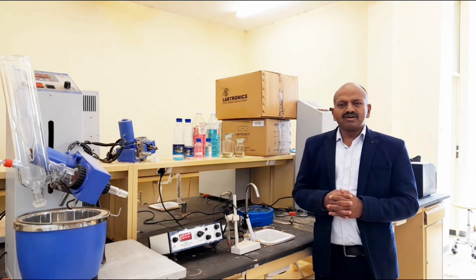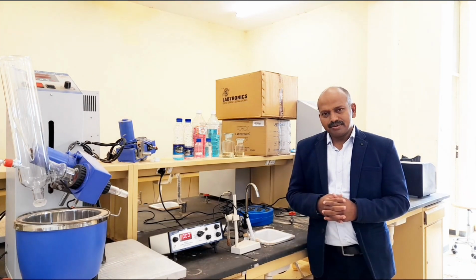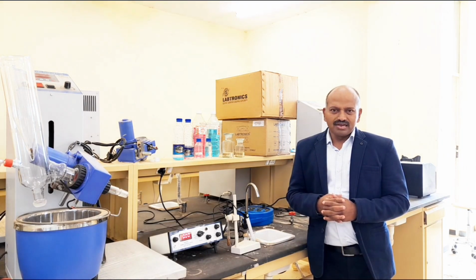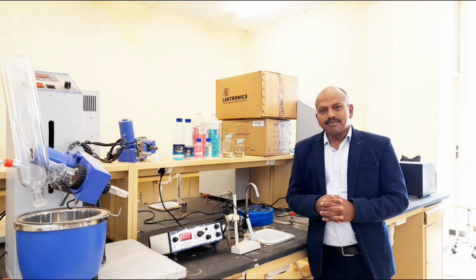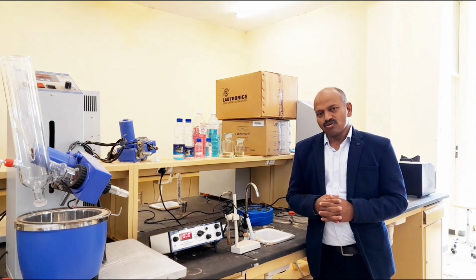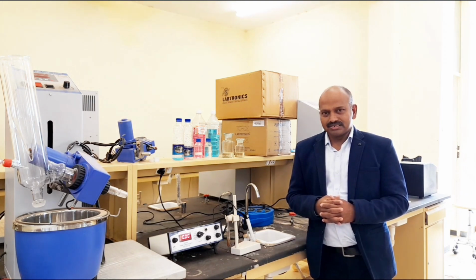The apparatus required for this experimentation consists of the burette, pipette, volumetric flask, small beakers, magnetic stirrer, wash bottle, measuring cylinder, etc. This is about the apparatus. Coming to the chemicals required, they are sodium chloride, sodium hydroxide, and hydrochloric acid. The indicator used in this experiment is phenolphthalein, so the end point will be pink color to colorless.